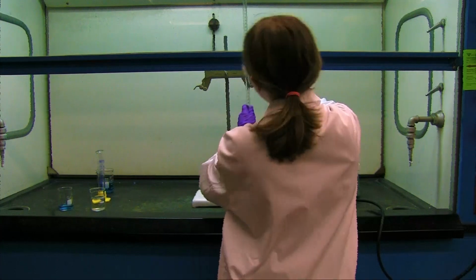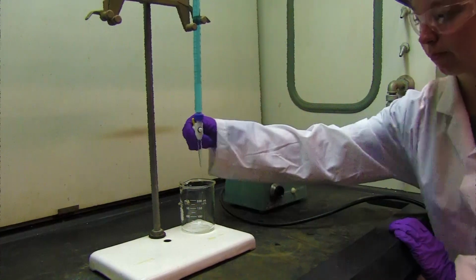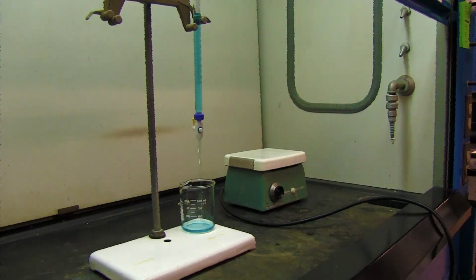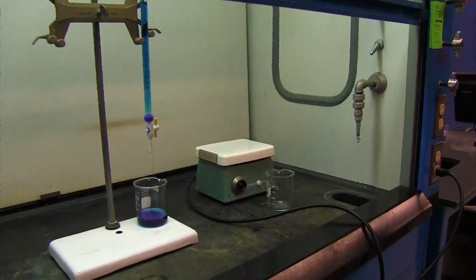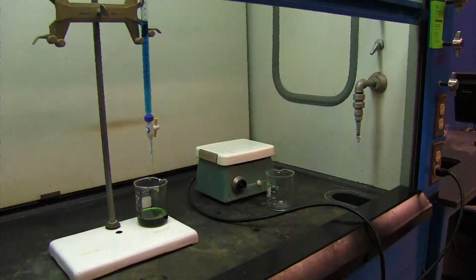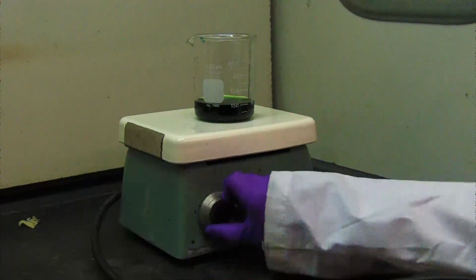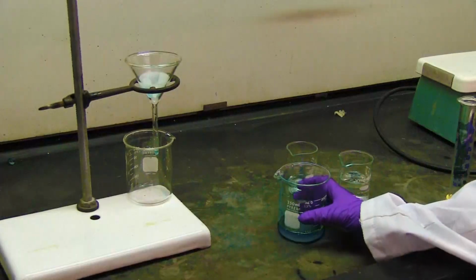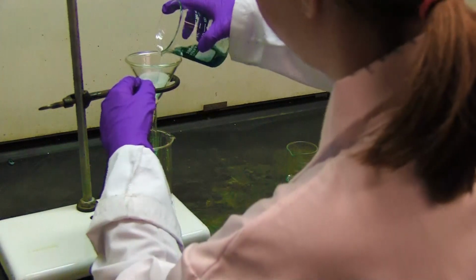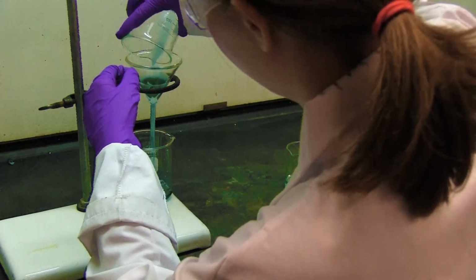Set up a ring stand, burette clamp, and a 50 milliliter burette to conduct the titration. Rinse and fill the burette with a sulfuric acid solution. Titrate the solution with the sulfuric acid until the solution changes to a deep green. Use a hot plate to warm the beaker of mixture containing the barium sulfate precipitate to a near boiling temperature for about 5 minutes. Allow the mixture to cool and then filter using a ring stand and filter funnel. Dry the precipitate and filter paper in a drying oven for at least 15 minutes.